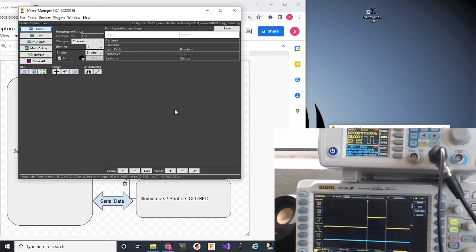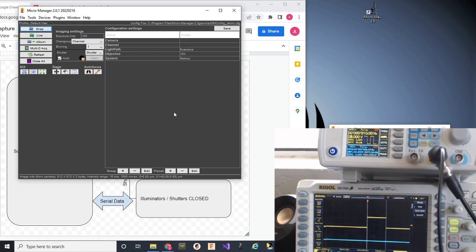Not only is it longer than what the exposure time should be, it's also jittery. And that has to do with serial communication and how USB to serial data is processed in the computer, plus the device receiving has to go and do whatever it's told to do. All of that builds into jitter in the system. This is totally usable, but it's important to understand the price that you're paying. In the case of a 100 millisecond exposure, my cells are receiving potentially toxic photobleaching for 25% longer than they need to. And it's wasted energy because I'm not getting any data out of it.